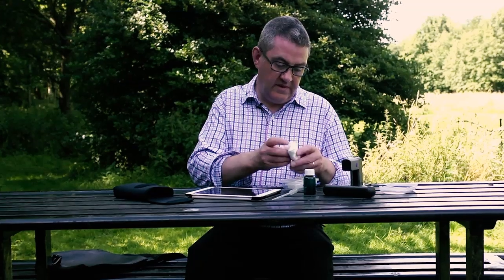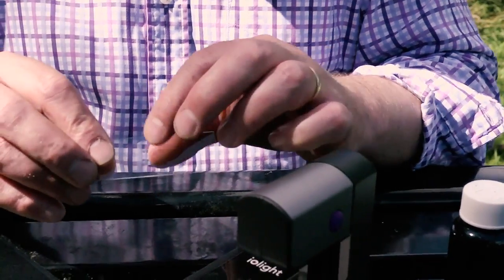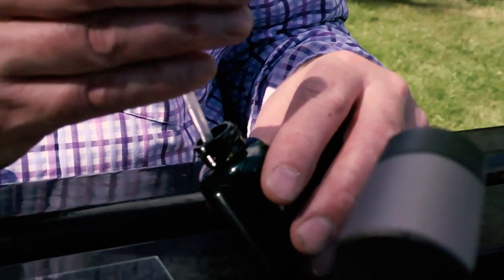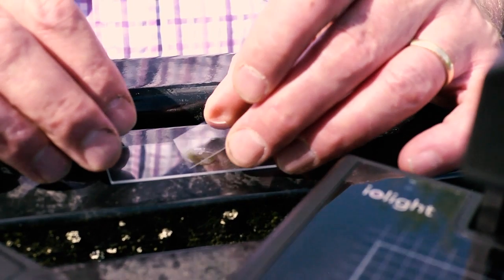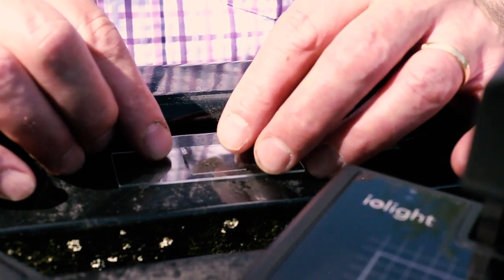Now to have a look at the sample. Standard microscope slides — you can get these from lots of educational suppliers, and these ones are called cavity slides. They have a little well in the middle to hold the sample. So we put that down there. Now in order to make the sample flat we use cover slips, little thin squares of glass. Watch your fingers on these — they're quite sharp if they break. Put that on the top to make the sample flat.